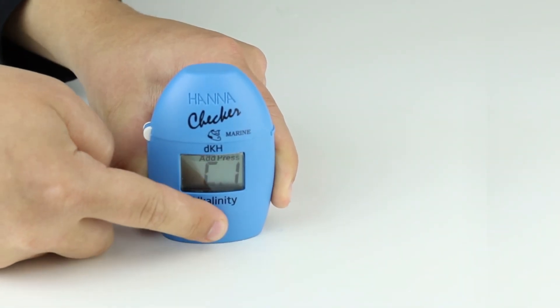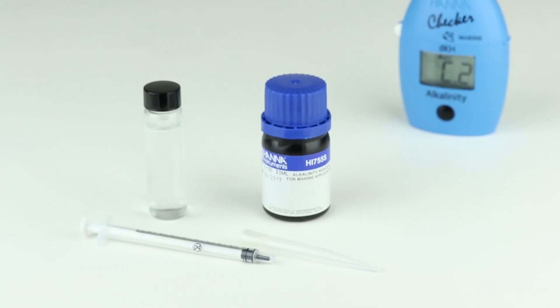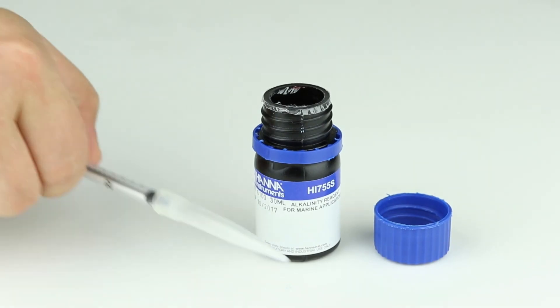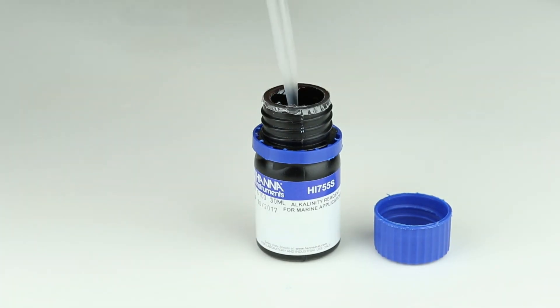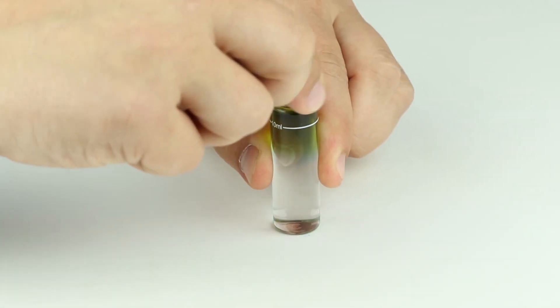Press the button. Once the screen shows ADD-C2, place the tip on the syringe and extract 1 ml of reagent from the bottle provided. Once the reagent has been added, cap the cuvette and invert 5 times to mix.